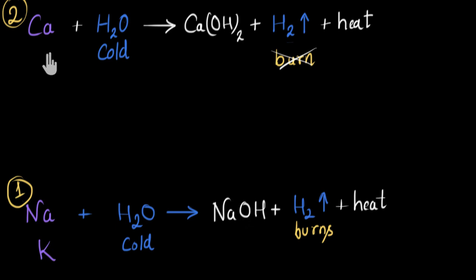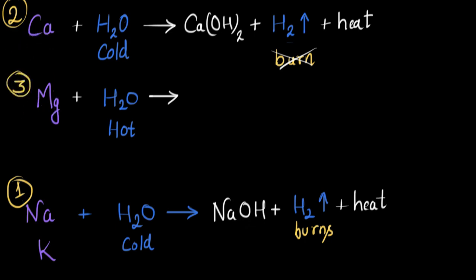Now next we have magnesium metal, and this also reacts with water. But this cannot react with cold water. Cold water does not have sufficient energy for magnesium to react with it. So that's why we will need to heat the water. So magnesium reacts only with hot water. So this itself is an indication that magnesium is not as reactive as calcium. So we will rank magnesium as third in the list.